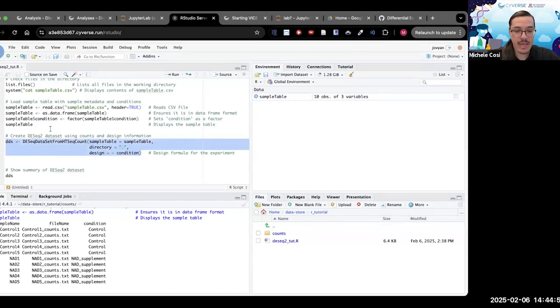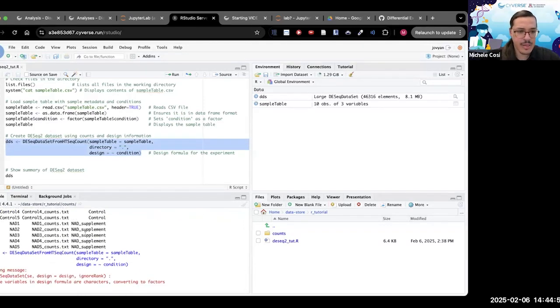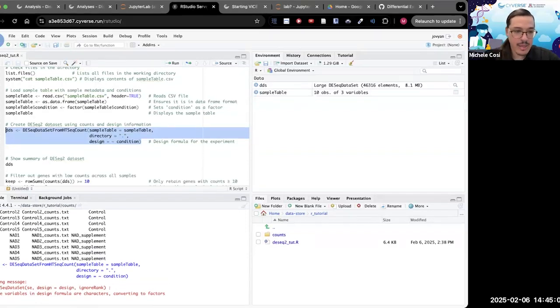So we're just going to go ahead and run this. It is a warning message. Don't worry about it. I need to move this over here. It is a warning message, but it still runs. Warning messages are not errors, nothing breaks, but you need to keep in mind something may not be working as intended.